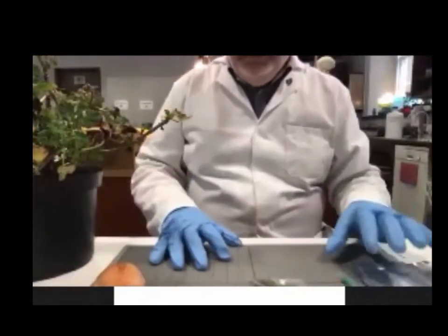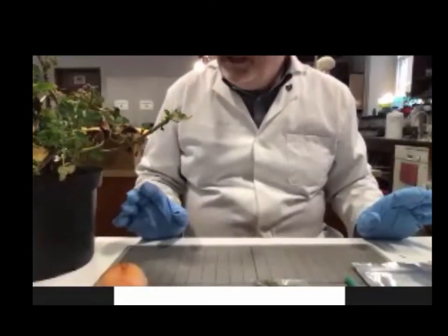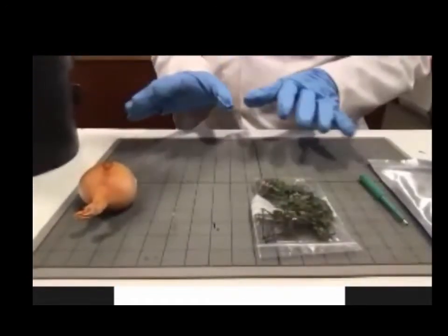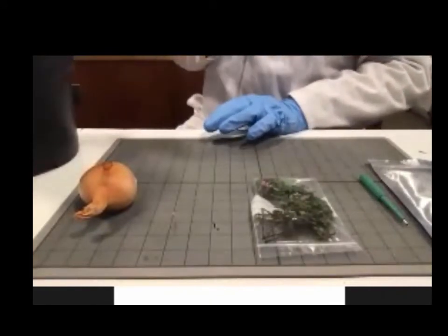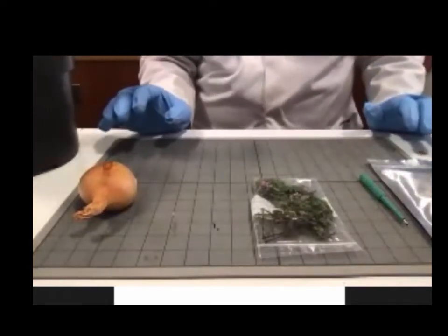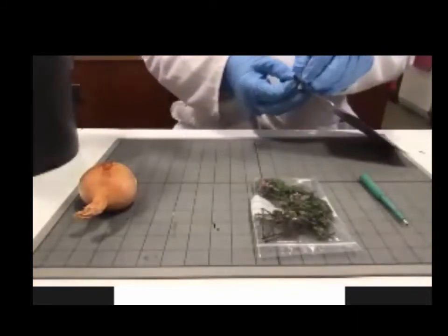One of the things is about extracting DNA, and I'm going to show you two methods here. I'm also going to run through another method asynchronously, so you won't have to worry about it. We'll do that after I let you go. But in the meantime, this is what we've got here.